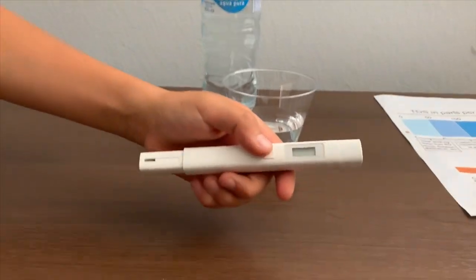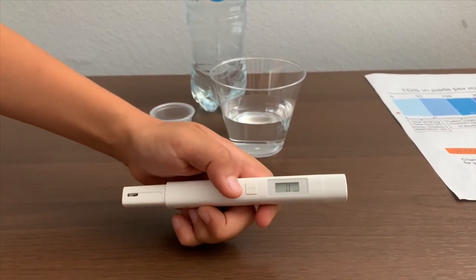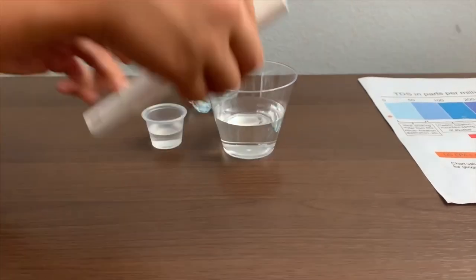If you want to buy this TDS tester, check the link down below. Turn on the TDS tester, make sure it says zero, and put it in.